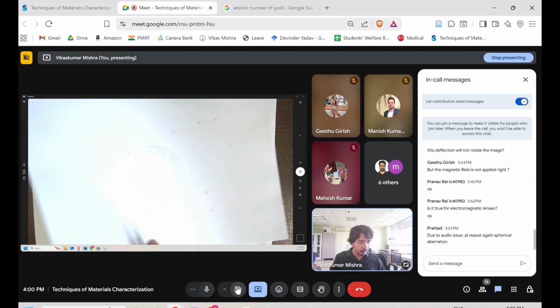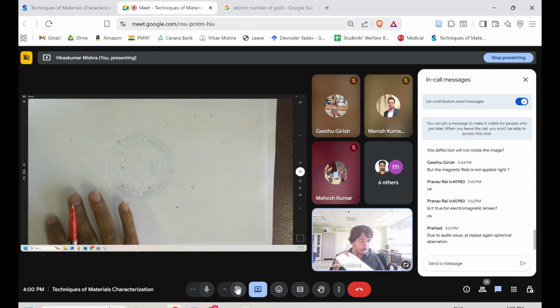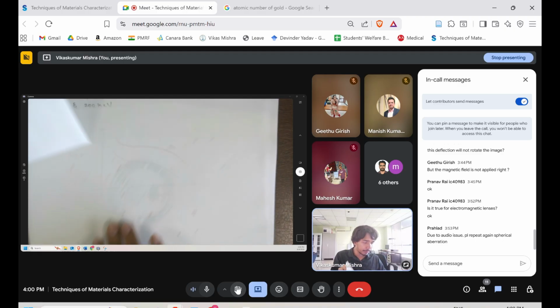So now, yeah, I want to discuss a few things here. Let's talk about the transmission electron microscopy. The thing which was discussed in the class, I will try to cover that part.